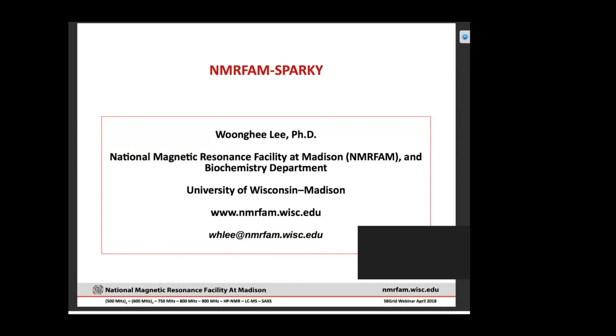I'm going to talk about NMRFAM-Sparky, which succeeds UCSF-Sparky that has not been developed for a long time. I officially took over this development in 2014. Since then, I developed many features inside NMRFAM-Sparky, reflecting the advances in current NMR technologies. So I'm going to talk about this today.